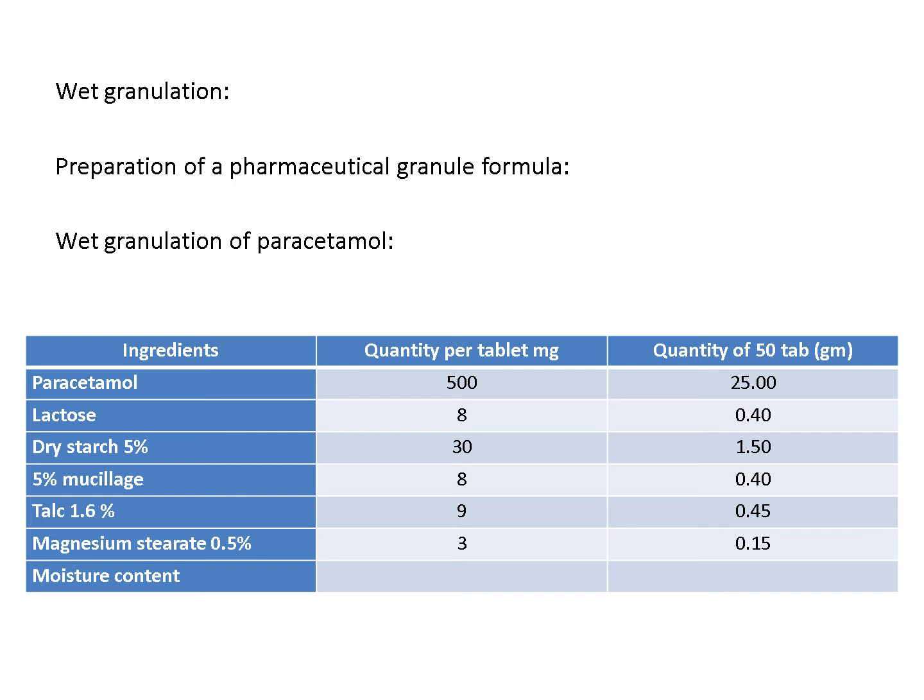If I have an active ingredient less than 50 milligram, I will add a larger amount of diluent such as lactose to increase the tablet weight, to make it bulky, more noticeable, handleable, and weighable. But because 500 milligram of paracetamol in our tablet is weighable, handleable, and noticeable, I need a very minute amount of lactose.